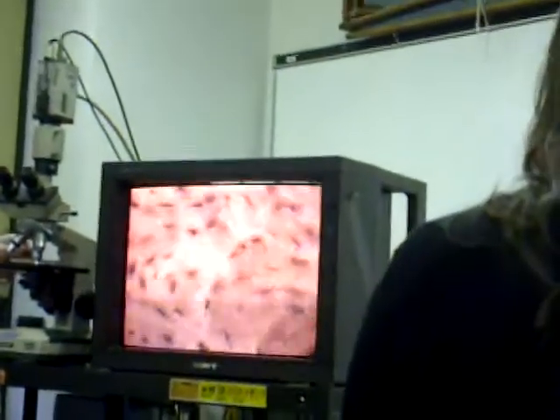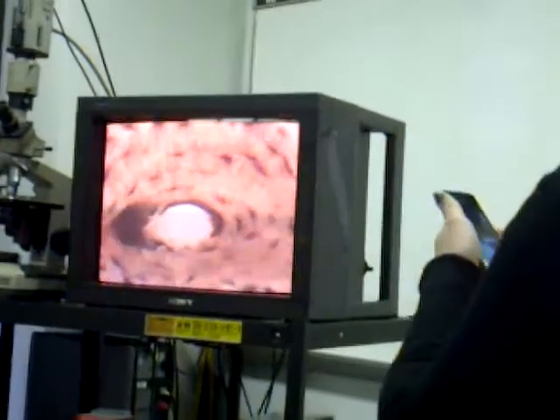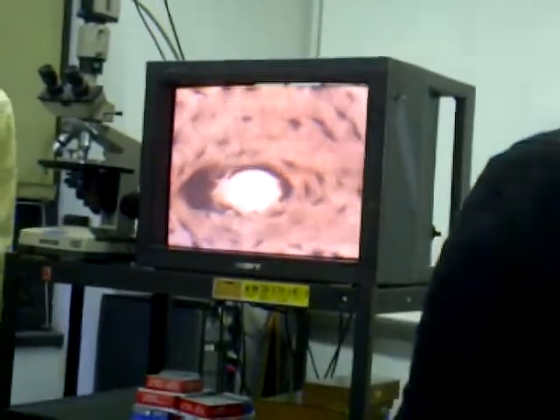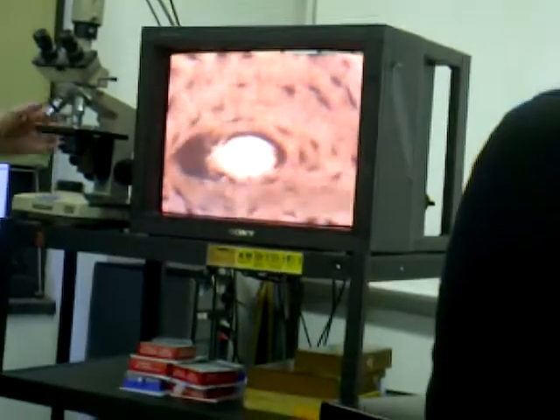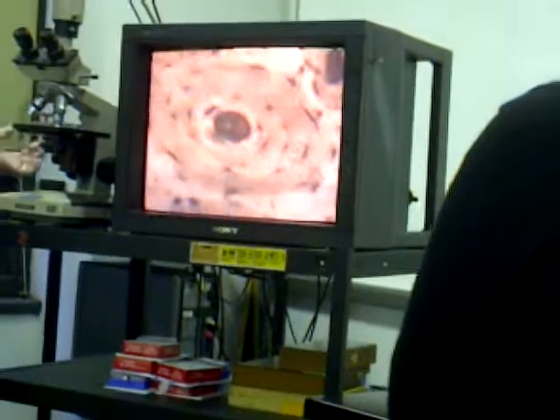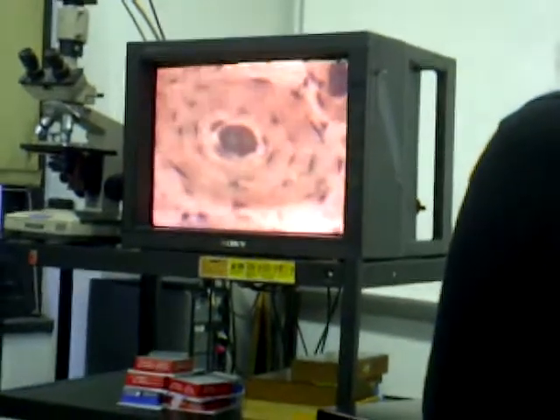Because also sometimes you'll find, depending on which ones I get, that the Haversian canal is not black, it's white. And you'll say, oh, I was all confused, I thought the Haversian canal was black. Well, black and white just is whether or not the powder is still packed in. Some of them look part white and part black, depending on whether some of the powder has fallen out. So that's a Haversian canal, and it looks all white. That's a Haversian canal, and it looks all black. It's just that the powder is still stuck in it, and so it looks black. But if you understand how the slide is made, you won't have to memorize the details.